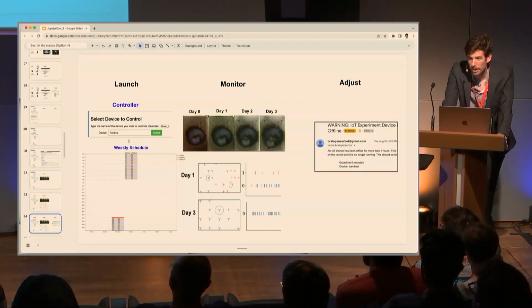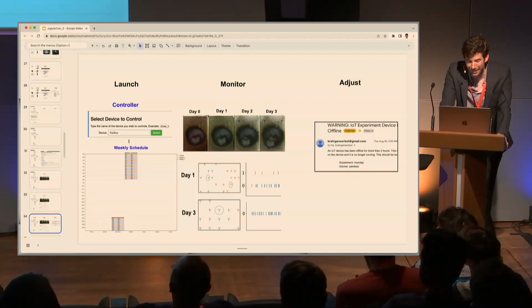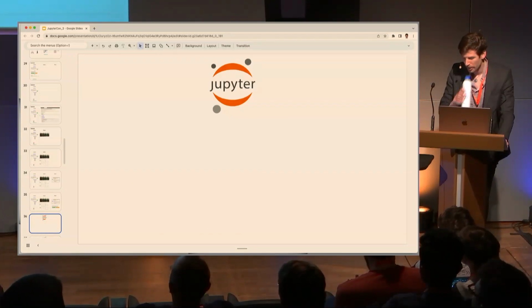And also we built in fail-safes. So if this experiment breaks, we have code that looks for it, sends emails to everybody. A biologist will run in and try to save things last second. And that has been very useful. The biologist will understand why that is useful.